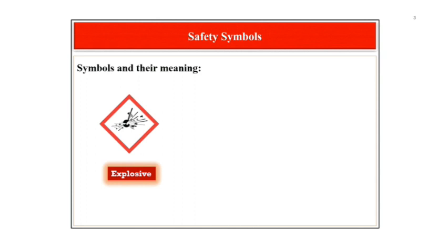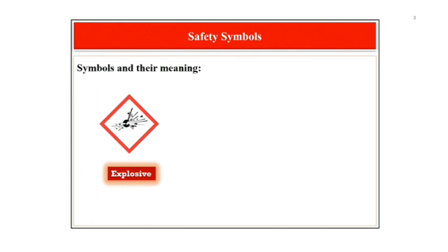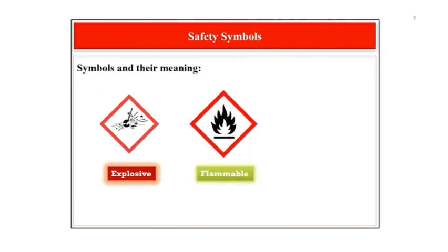This is the symbol for explosive, which includes an exploding bomb. The exploding bomb symbol will appear on chemicals in the lab that have explosive properties. These include unstable explosives, self-reactive substances and organic peroxides.